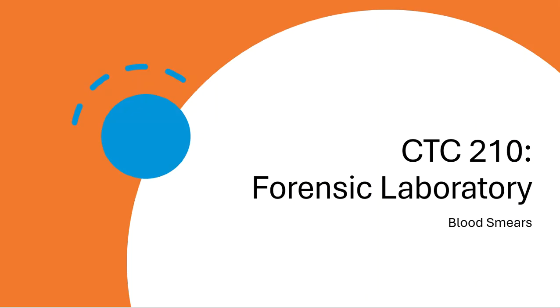So what you're going to see in this presentation is me gathering a slide from one of many and putting it onto the microscope, setting the microscope at the proper settings, and being able to analyze the slide and taking a closer look at the sample that might be present on the platform.